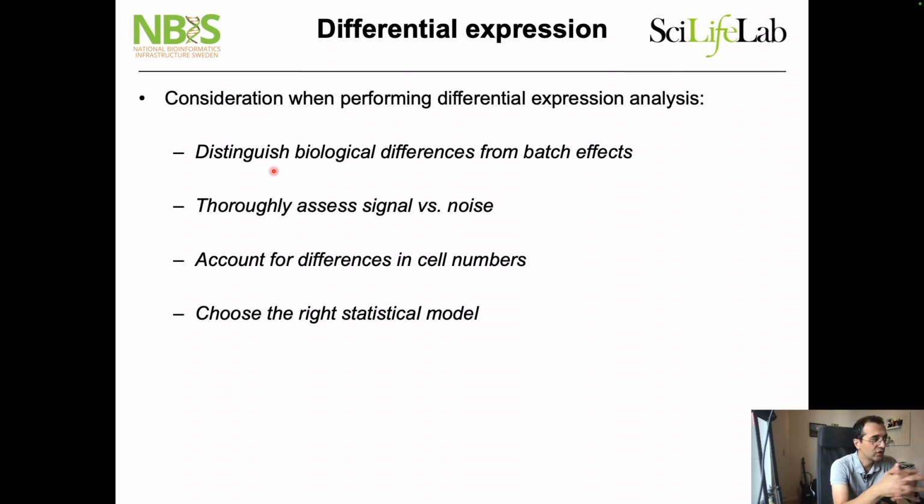In the practical, you will also correct for that, to have a fair number of cells for your differential expression, because if you have a very uneven, very large difference in number of cells, it can influence the differential expression. And choose the right statistical model. We can test a few tests that I told you, and usually I use the non-parametric, and it works fine.